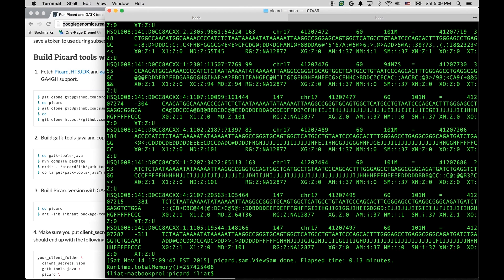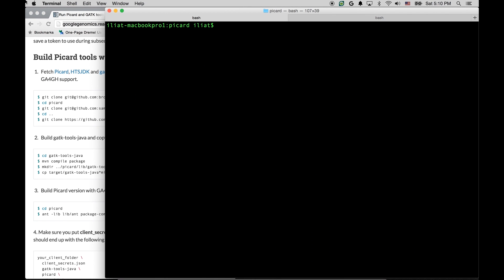Now, this is not the only tool that we have converted. We can run another tool, for example, mark duplicates in a similar manner. Here we specify the command line as usual, and the input is again the URL that points at our data in the cloud. Let's see this.